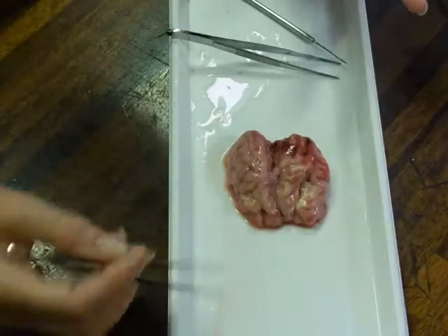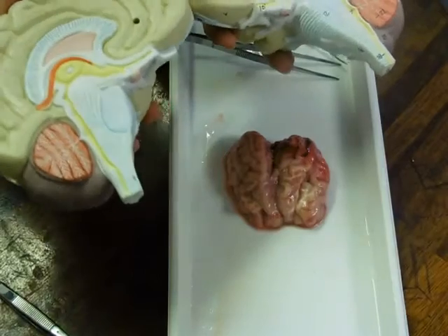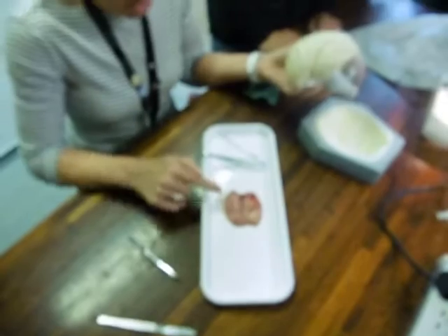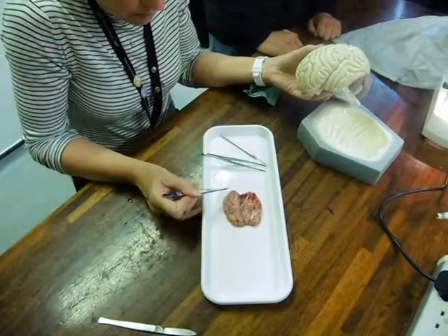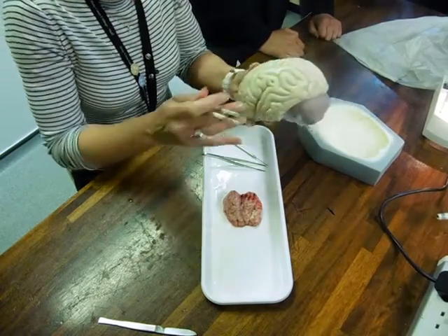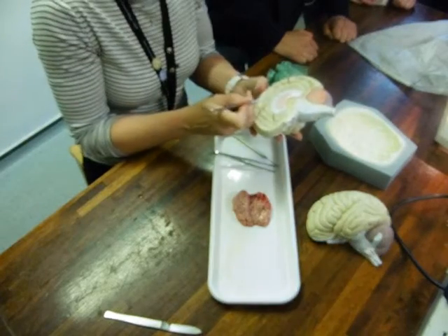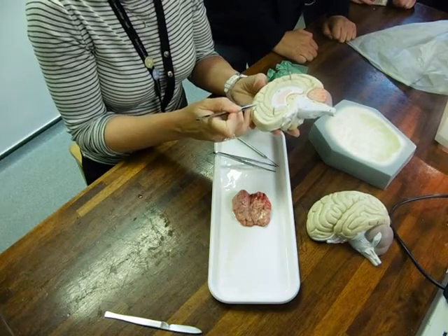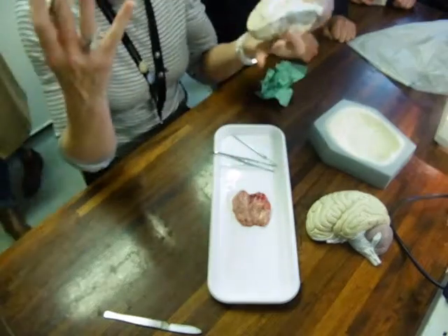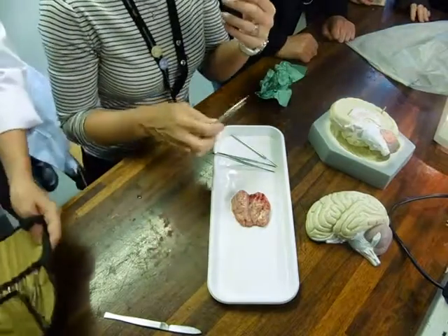I don't know what I'm going to get when I cut it open, and I'm guessing that it's not going to look like that. I'm thinking it's going to look like a pile of mush, right? But you can see, looking at their brain there, that it's got all the folds. And this is the cortex, and the whole of this top bit here, all this folded bit and the stuff that's underneath it is the cerebrum, and the top bit of it that's folded is called the cortex. That's where you do all your high level stuff.